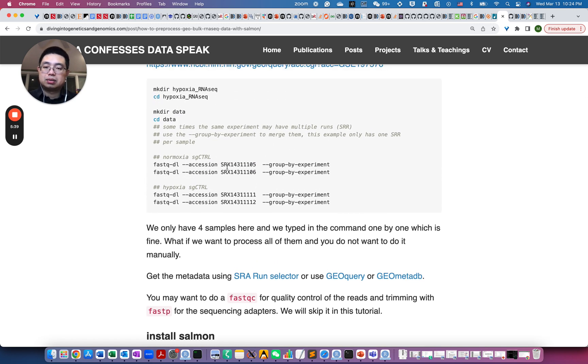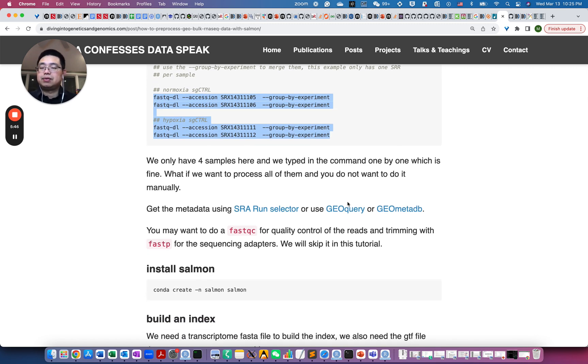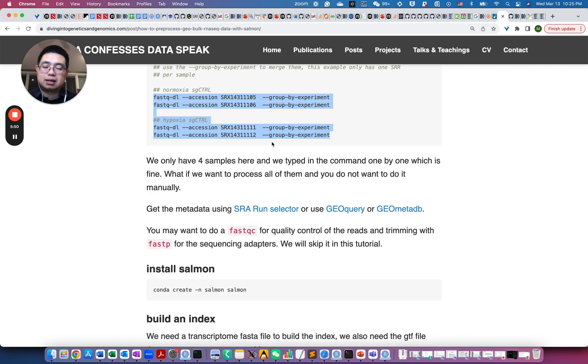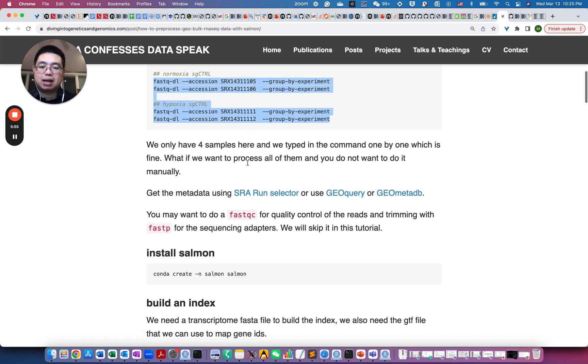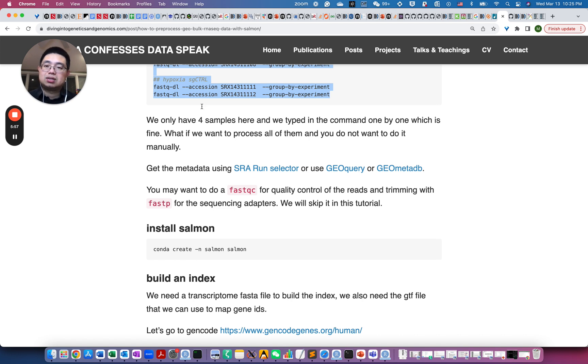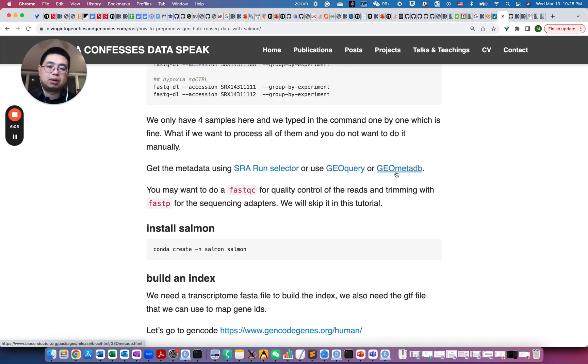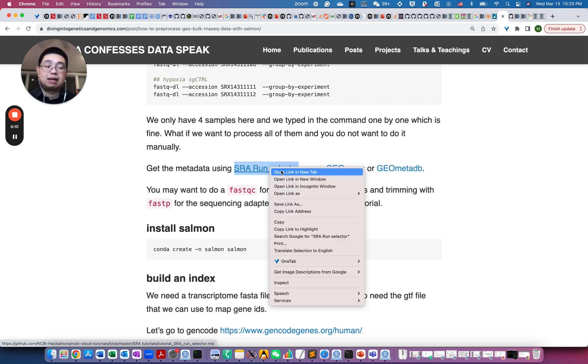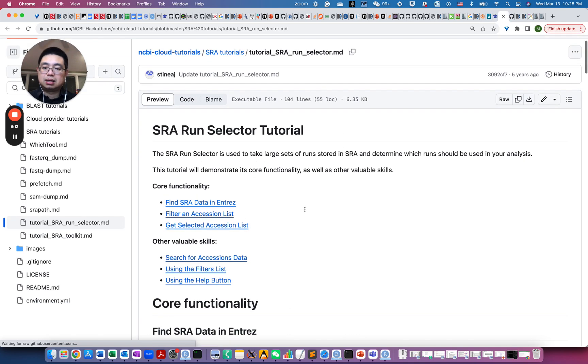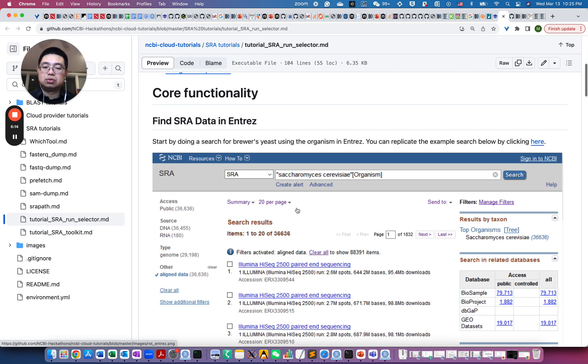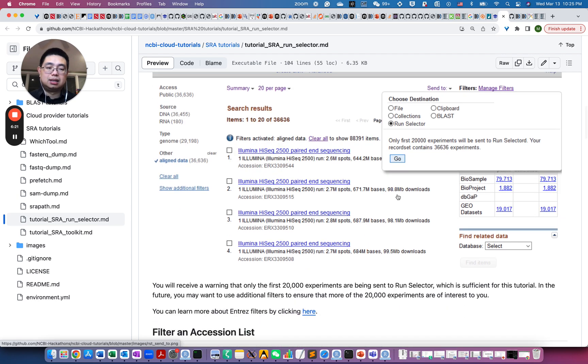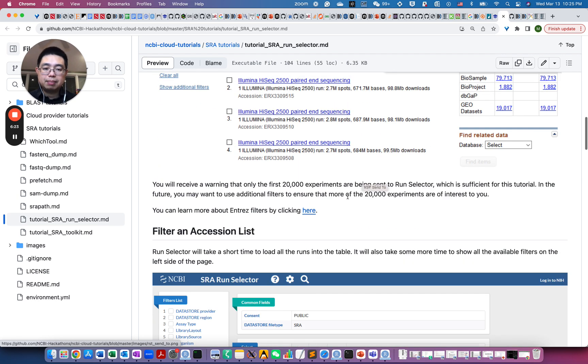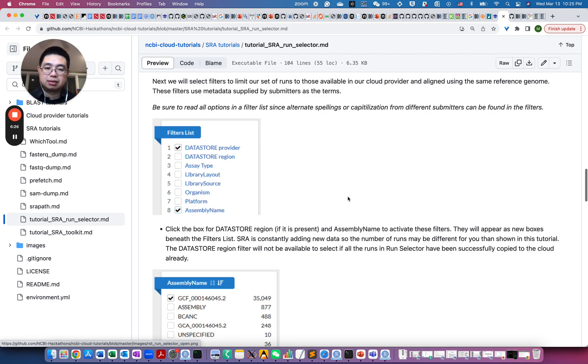Because we only have four samples, so we can type those commands actually line by line, it's fine. However, if you want to actually download all the files, I think it's 12 samples or something like that, maybe it's kind of tedious to just write this line by line. So instead you can actually get those metadata or those SRX numbers by using the SRA run selector, or you use R package GEOquery or GEO meta database. I have link here, but you can take a look at how to use the SRA run selector, how to select the metadata from the web interface.